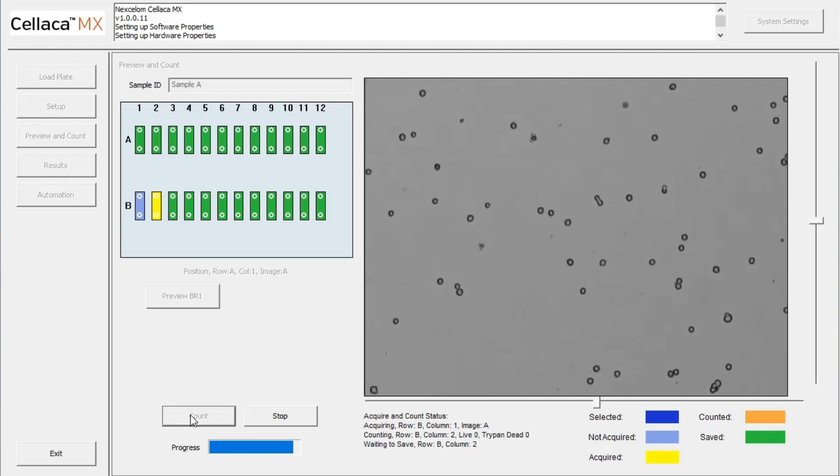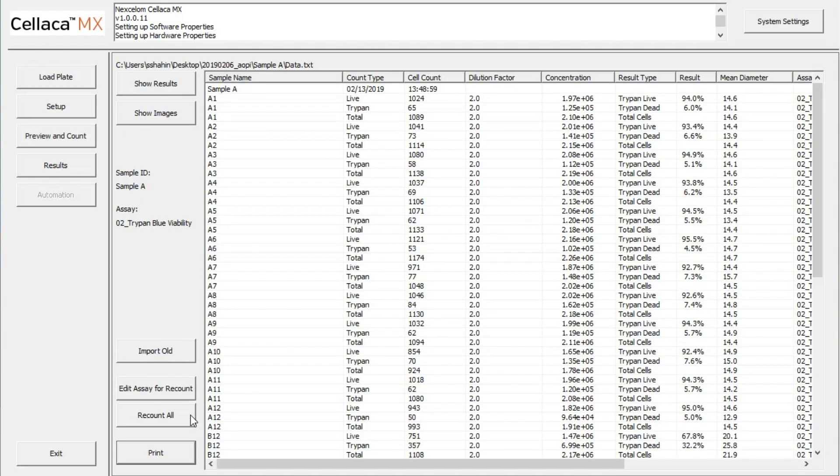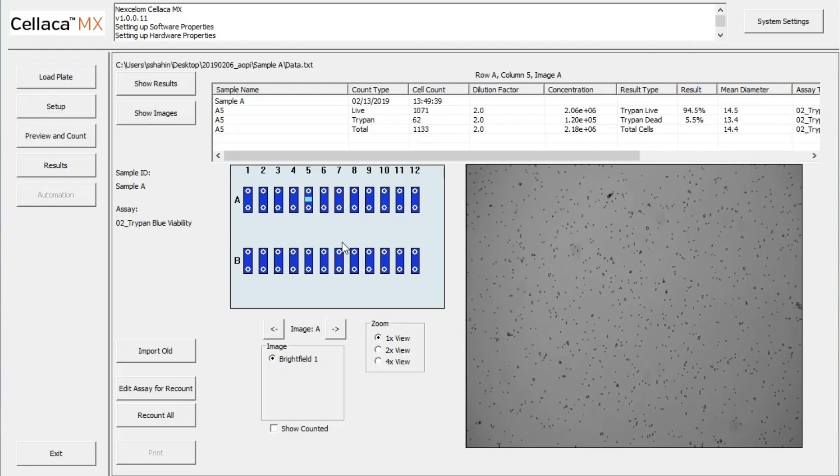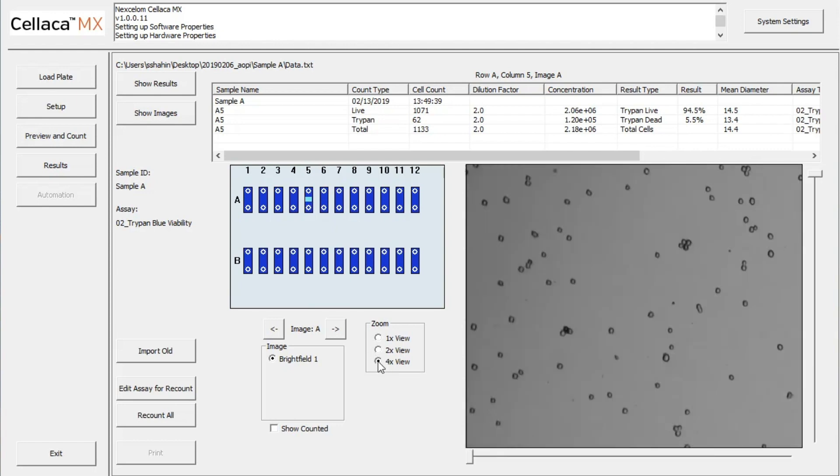When cell imaging and counting is complete, the results table displays available parameters associated with the experiment. Click Show Images to view all captured images, or click on a single well to see the associated Brightfield and counted images.